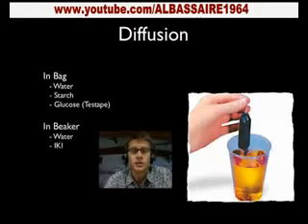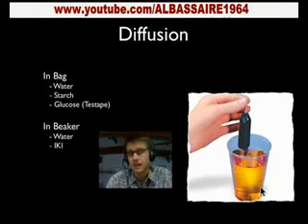Okay, now the two parts of this lab are pretty simple. The first part is diffusion. In diffusion, you'll have to imagine a beaker like this, but this is before the actual experiment. Inside this beaker, inside this cup, we've got water, and also inside that water we have a solution of IKI, which essentially has iodine in it. So it's a chemical that has iodine. And so to begin with, you've got a little bit of IKI, you've got water, and it looks kind of this yellowish color.